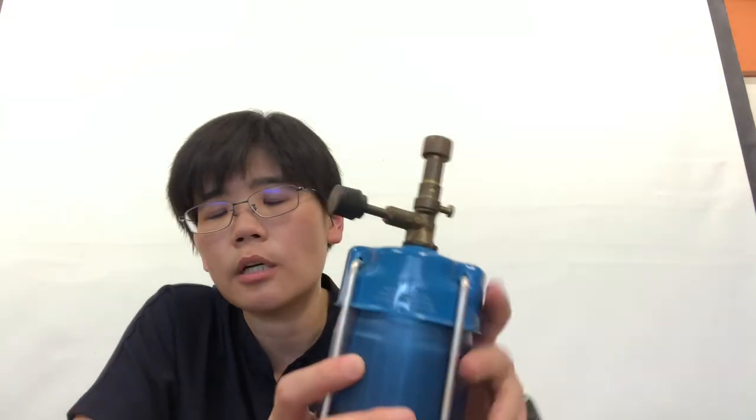To turn off the Bunsen burner, you shut the gas. Turn off the gas valve. So that's how we turn on and use the portable Bunsen burner in the lab. That's how we turn on and turn off the Bunsen burner. Thank you.